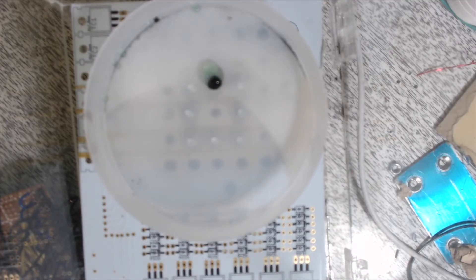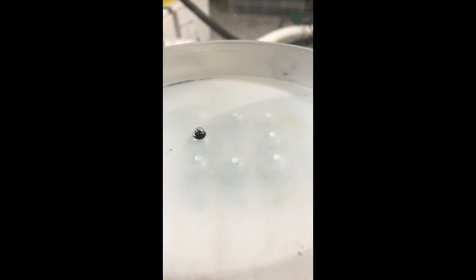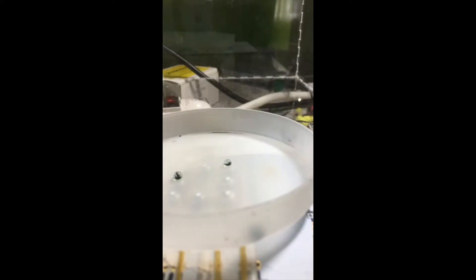Rather than applying large amounts of current to a solenoid to cause attraction, I merely invert the field strength of a particular ferritic screw head already placed in a continuous magnetic field. This requires only around 100mA of current to perform, and requires no power output once the droplet has been successfully maneuvered.